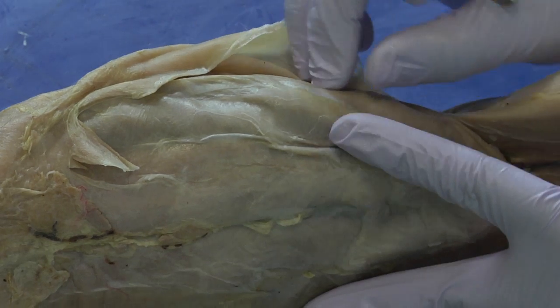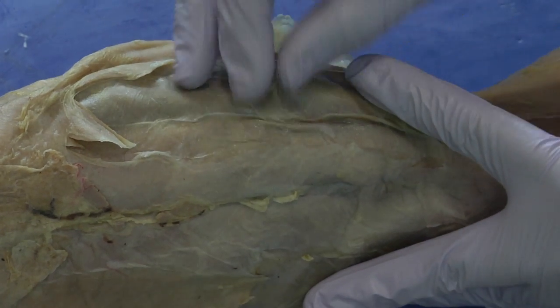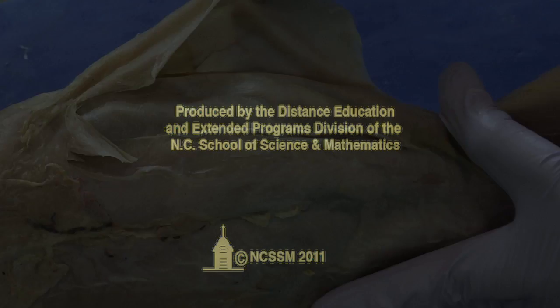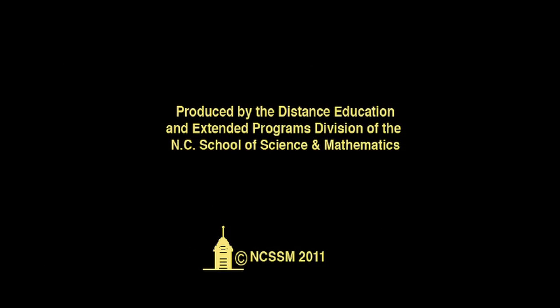So it's the external, the internal, and then more medial is the transverse abdominus.